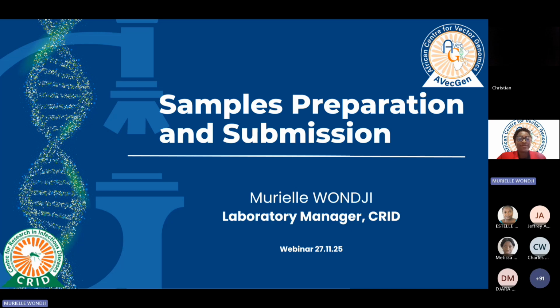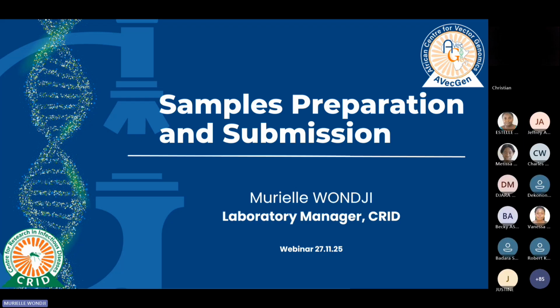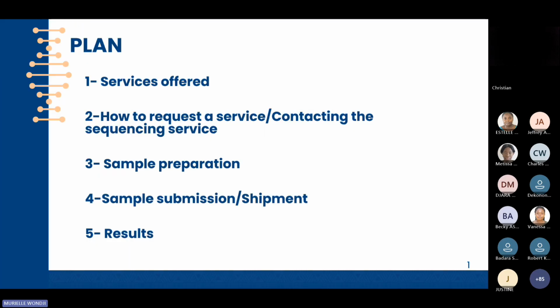Good afternoon, everyone. Thank you to the scientific community for joining this webinar, the first webinar at CRID. We move straight towards the sample preparation and submissions, which are key elements for us to be able to carry out Sanger sequencing at CRID. My presentation will follow this plan. We browse the service that we are offering now at CRID and how you can request the service, move to the sample preparation and submissions, then how you get your results and the different timelines as well.